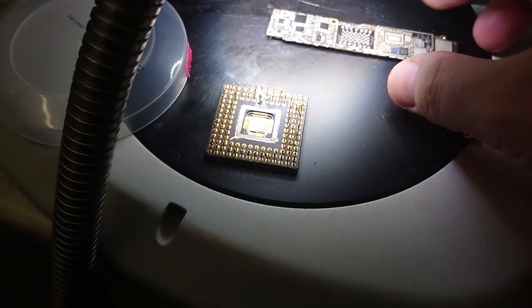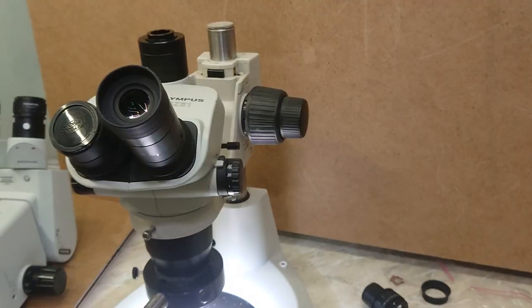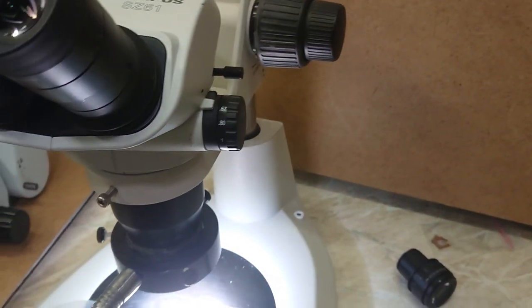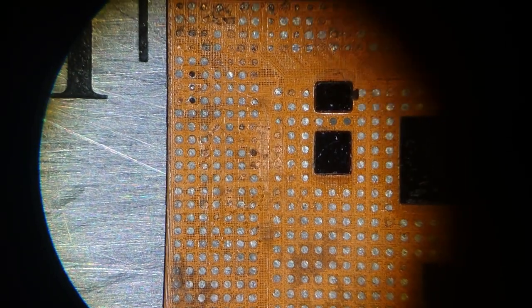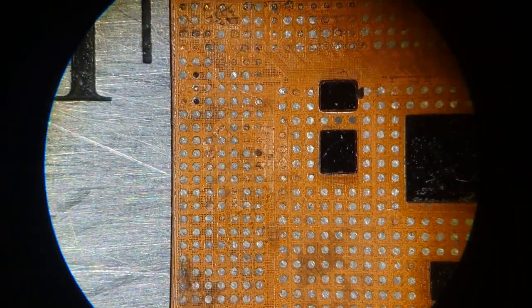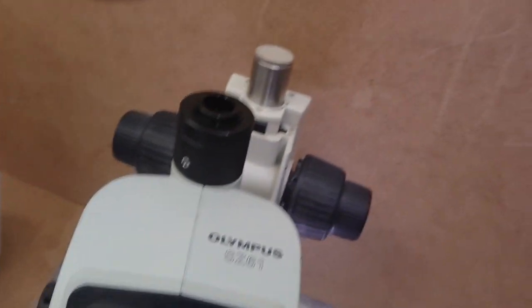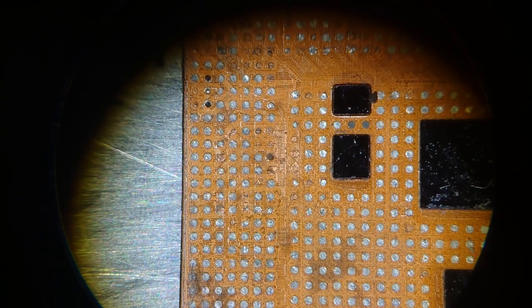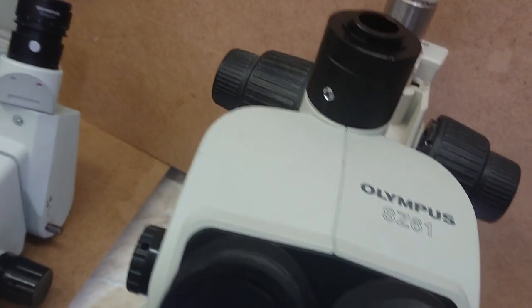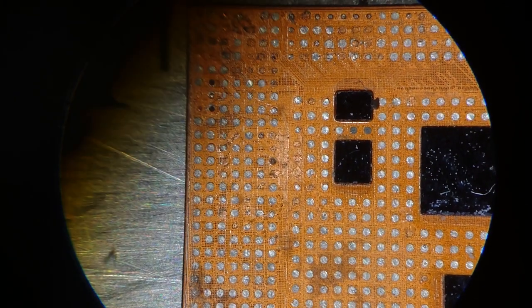We've just seen the field with iPhone motherboard. Now let's switch eyepieces and get to maximum resolution, taking as a sample some part of the A-series processor. Let me change eyepieces. So eyepieces have been changed. Let's try to look at the resolution of this very nice high contrast microscope of Olympus. Technically the field of view is not real now because we are using eyepieces with high magnification. So don't take the field of view as some real value. You just need to see how resolution works. Here's our processor and let's zoom in.